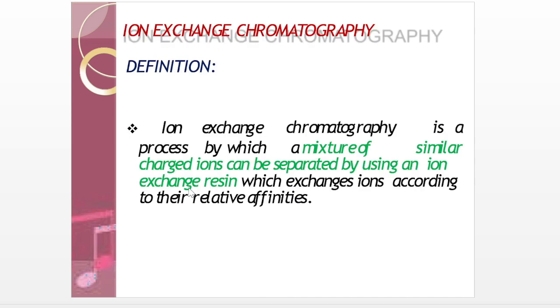Ion exchange chromatography is basically a process by which a mixture of similar charge ions can be separated by using an ion exchange resin which exchanges ions according to their relative affinities.